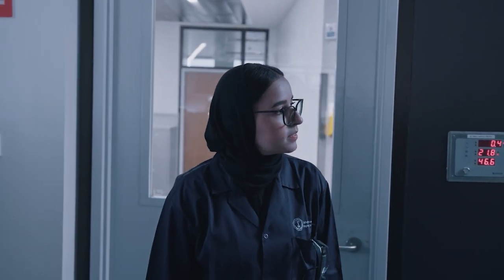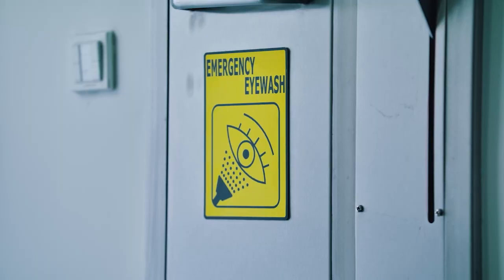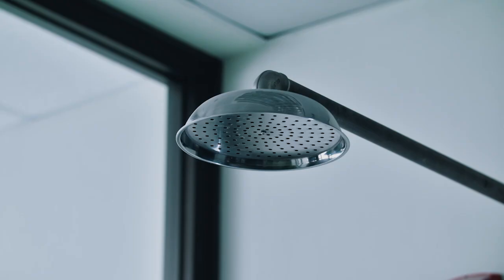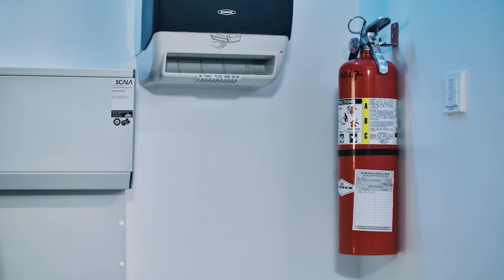As you begin to think about how you might respond to an emergency, take a moment to look around the laboratory when you first enter to identify safety equipment. Locate exits, eye wash fountains, safety showers, fire blankets, first aid kits, and fire extinguishers.